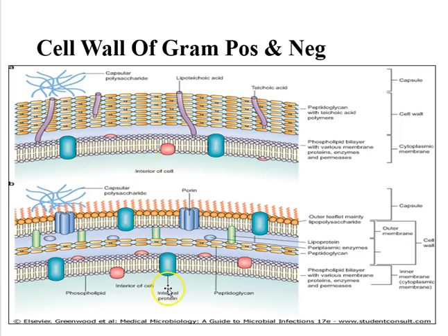Versus the Gram negatives, which have a thin layer of peptidoglycan, okay? And then on the outside of that, they have that LPS, that lipopolysaccharide that's sitting on the outside, okay? So this can easily be removed, just FYI, okay?